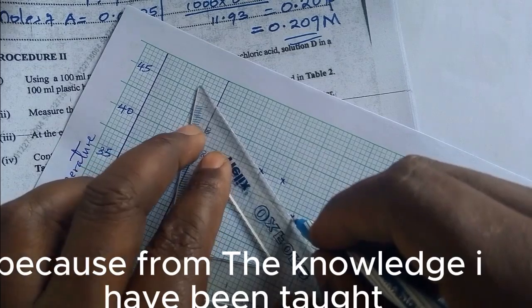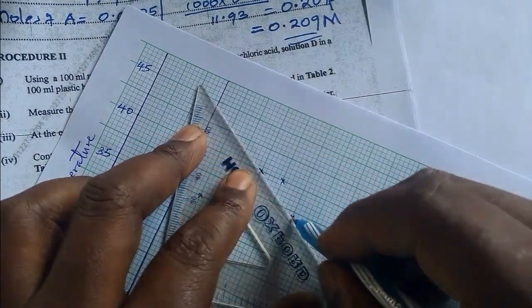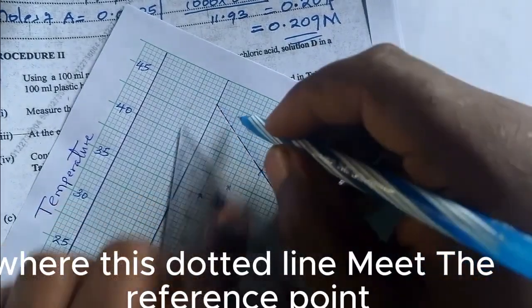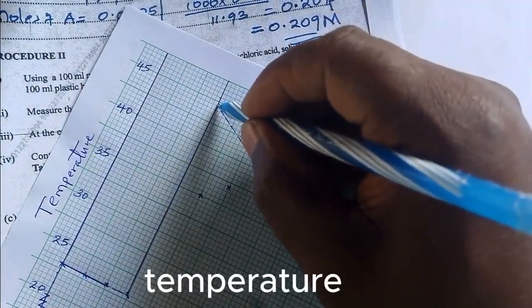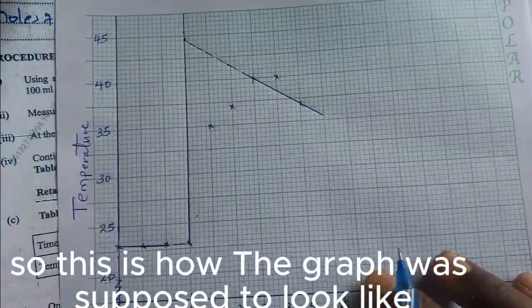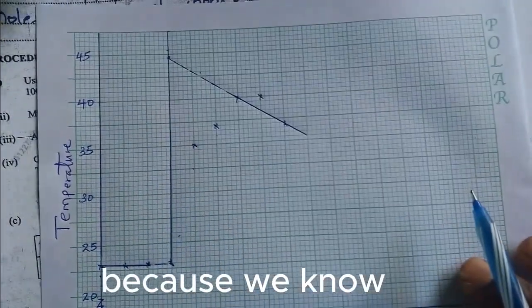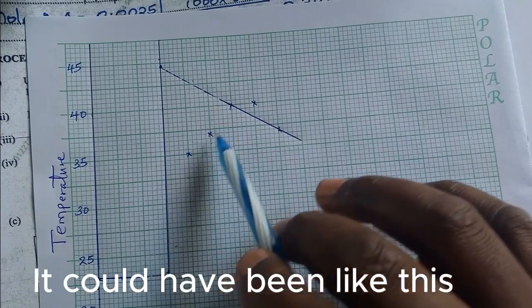Because from the knowledge I have been taught, I know that this line should be like this. So you draw a complete line and then a dotted line like this. Where this dotted line meets the reference point, that is our maximum temperature. So this is how the graph was supposed to look like. You ignore this one because we know for neutralization it could have been like this.